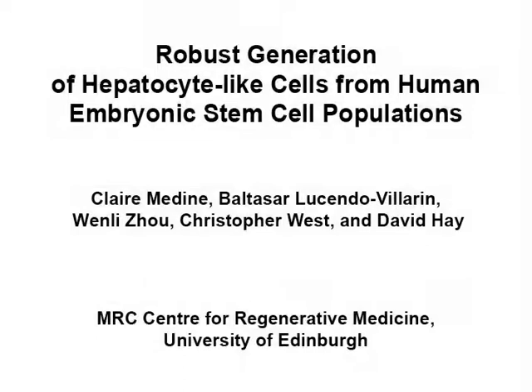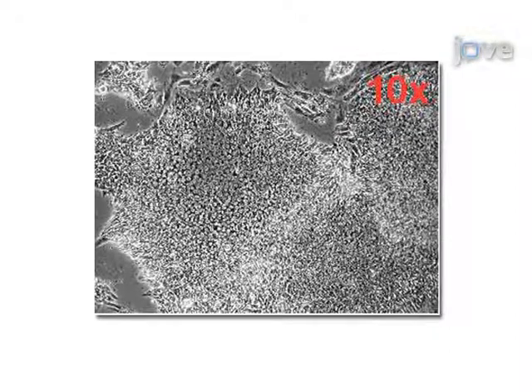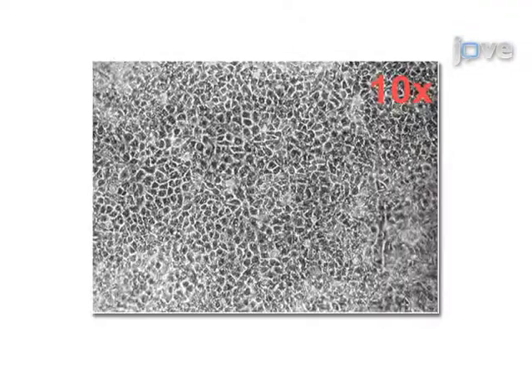The overall goal of the following experiment is to produce homogeneous levels of human hepatocytes to study human liver biology in vitro. This is initiated by driving human embryonic stem cells, or human ESCs, to definitive endoderm using physiologic stimuli, activin A and Wnt3a. As a second step, definitive endoderm is highly efficiently driven to hepatic endoderm.